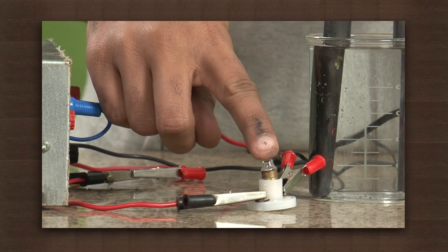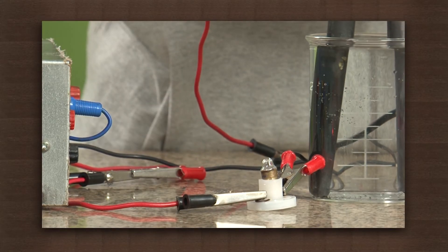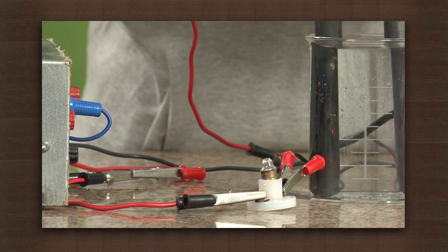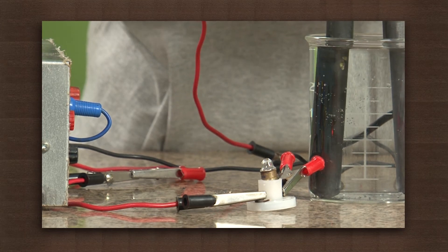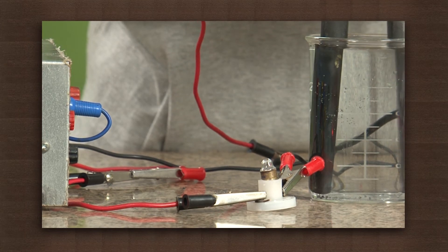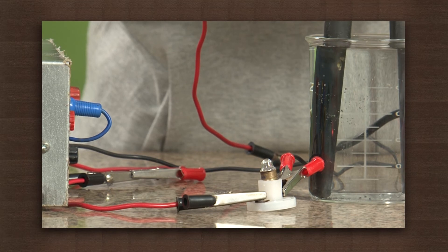The circuit will only be complete if the current from the battery eliminator flows through the water into the bulb. Now switch this circuit on. You will see that the bulb fails to glow. This means that the distilled water did not conduct electricity.